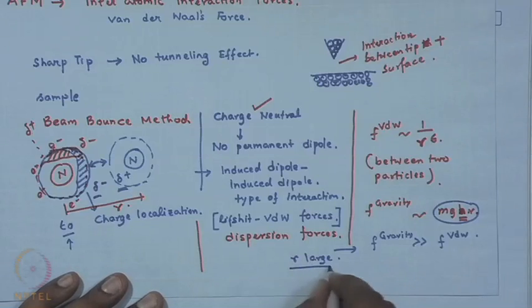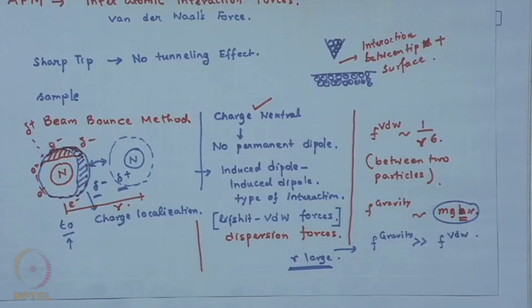But one of the reasons, of course, is that at these very small length scales, corresponding to a few molecular diameters, or let us say up to 10 or 100 nanometer, you have a very strong signature of these van der Waals forces, and gravity is almost absent. So, many of the so called spectacular phenomena one sees at these length scales are attributed to the fact that the intermolecular interaction forces have a significant role in some of those phenomena.